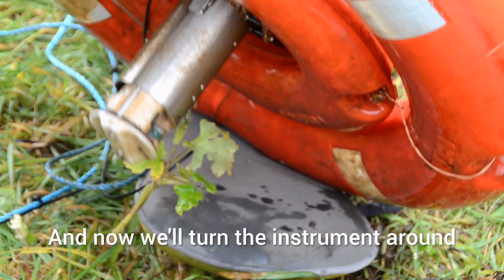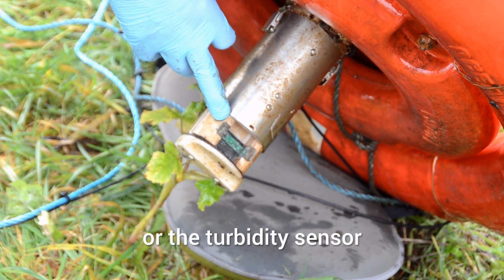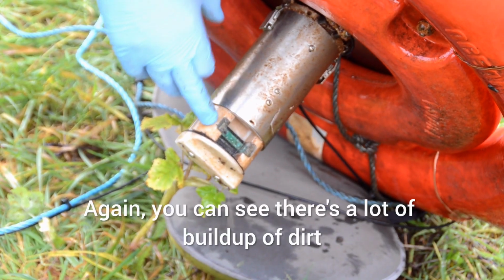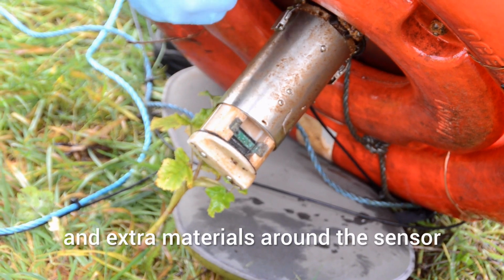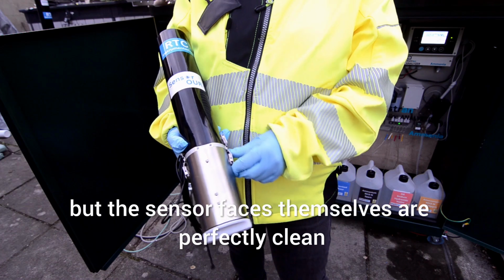And now we'll turn the instrument around and I'll show you the MLSS sensor or the turbidity sensor, which is the green sensing device here. Again, you can see there's a lot of buildup of dirt and extra materials around about the sensor, but the sensor faces themselves are perfectly clean.